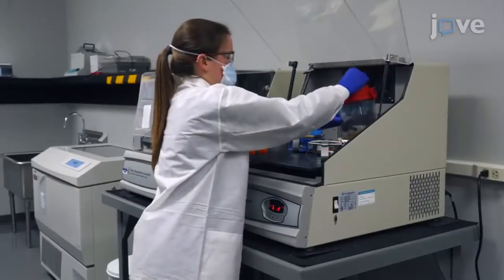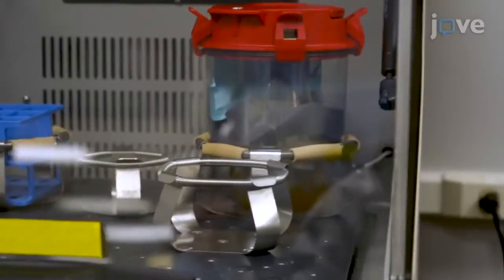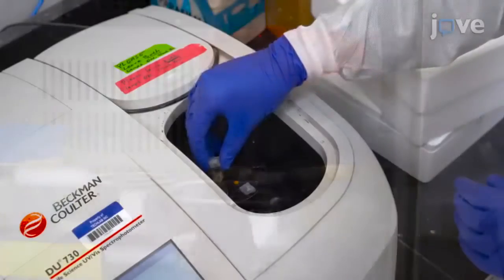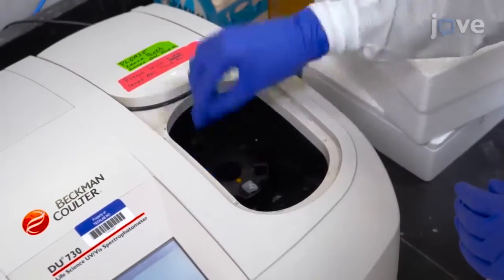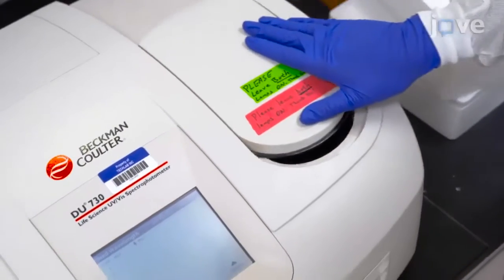Learning how many bacteria correlate with illness will provide diagnostics an important goal for detection and a solid method for comparing virulence between strains or species of campylobacter.